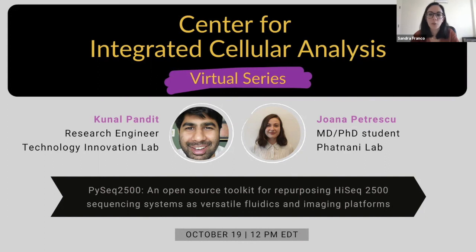So you have to input at least where your sample is. Is it possible also maybe to just do your imaging on certain regions of your tissue? For example, if you would be interested in, I don't know, ventral horn or dorsal horn, would it be possible for you to just restrict the ROIs that you want to image instead of imaging the whole sample and then maybe speed up the process?